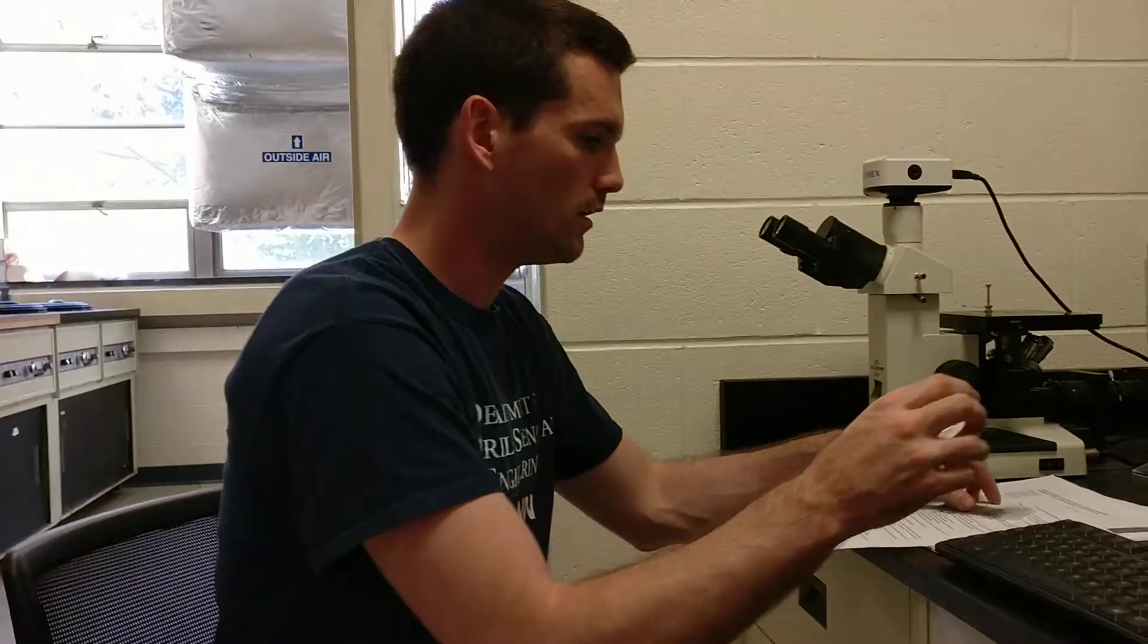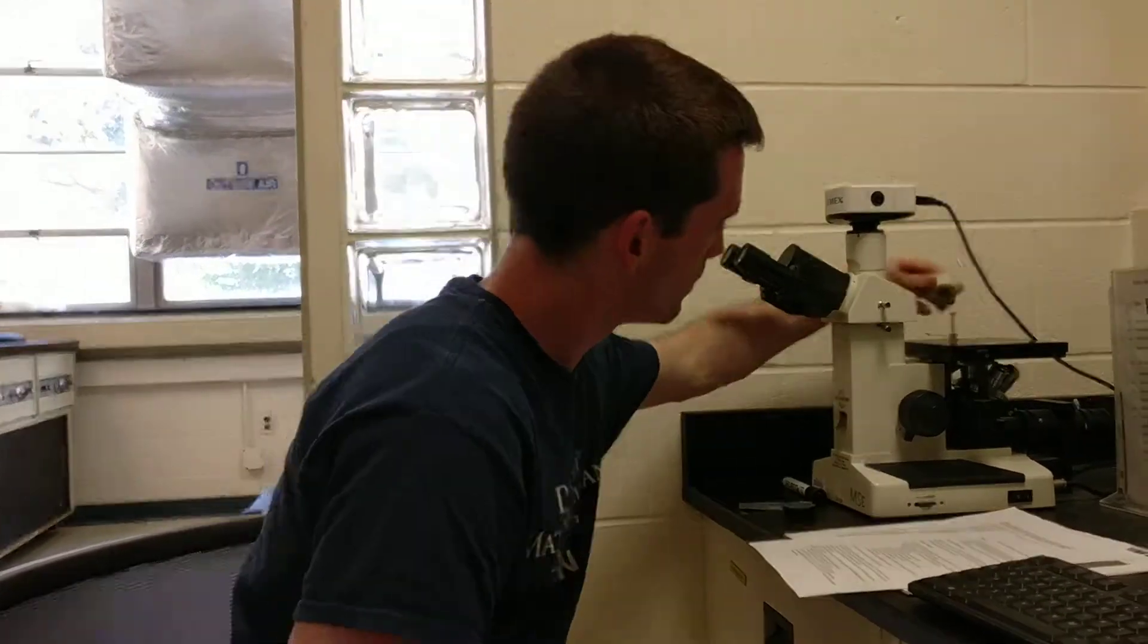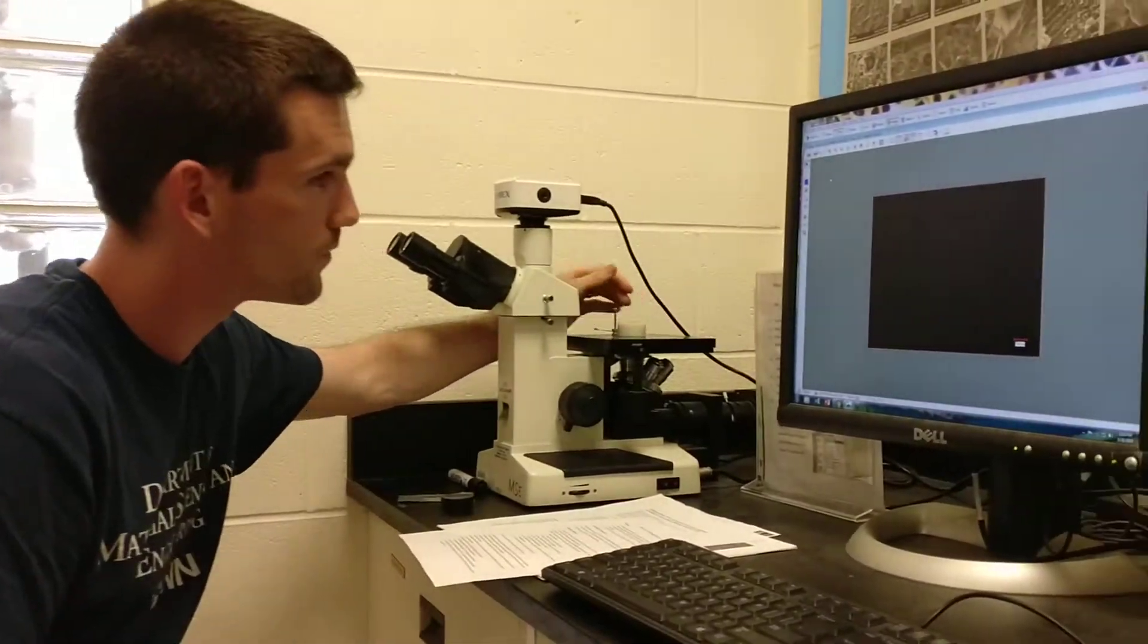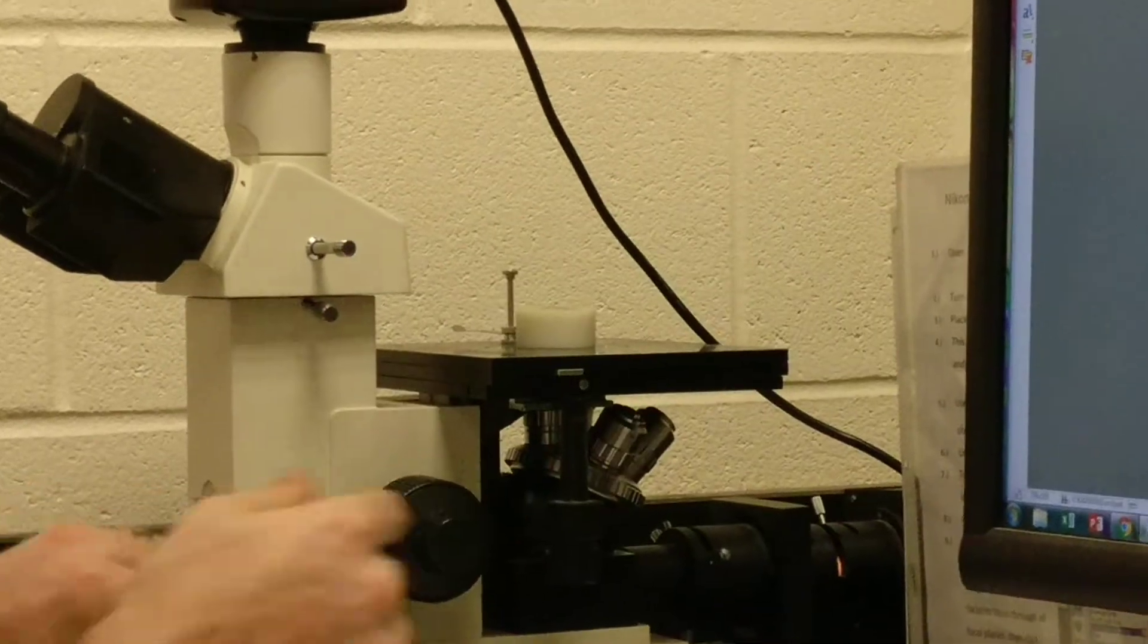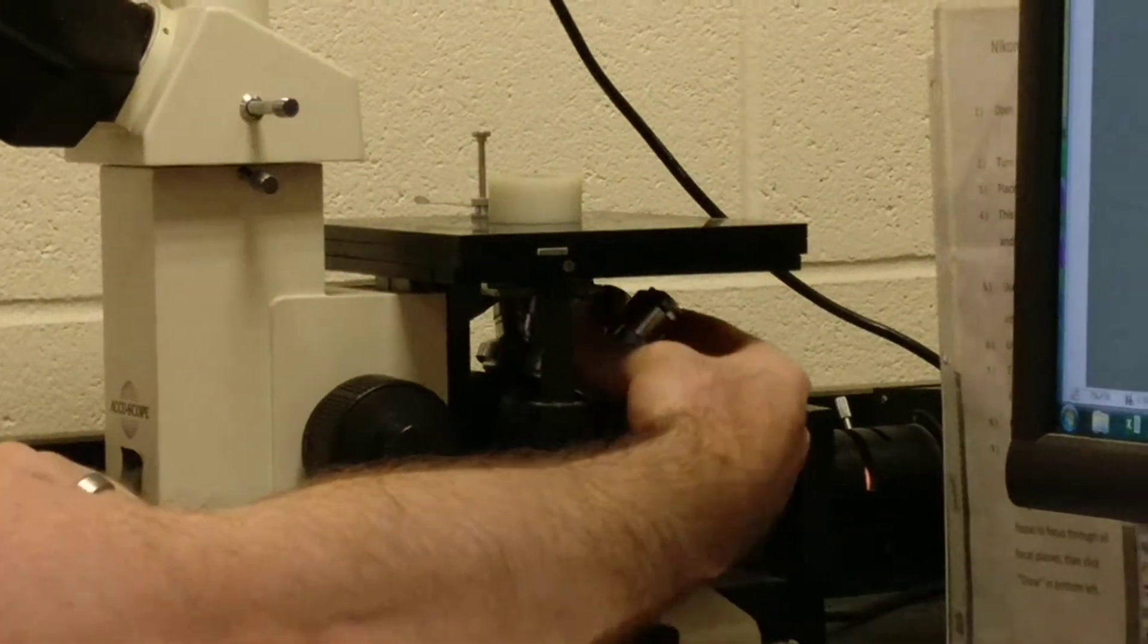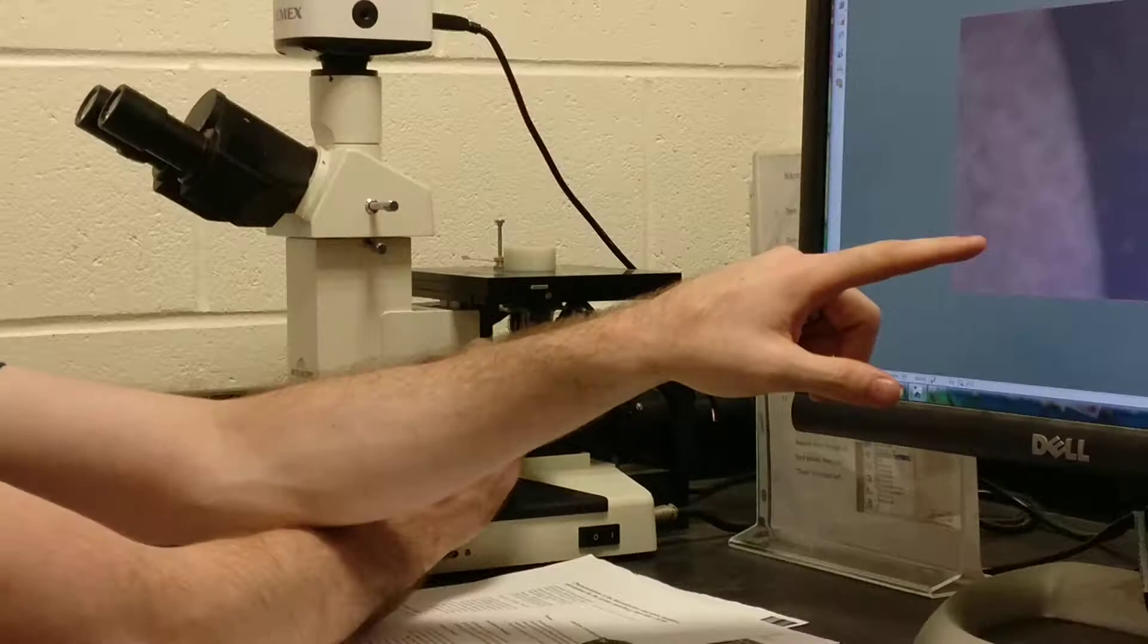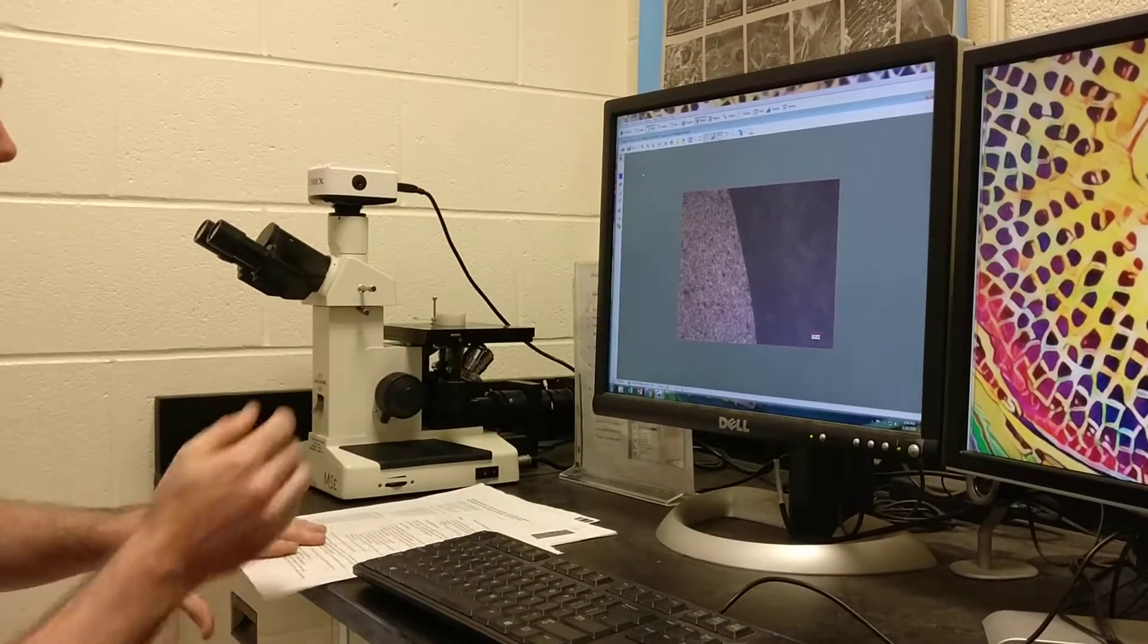The first thing we'll start doing is measuring these layers of the thermal barrier coating. Put the sample on the microscope, check that this pin is pulled out so we get light going to the microscope. Make sure that our objective lens is on 50x in order to find the edge of the sample.